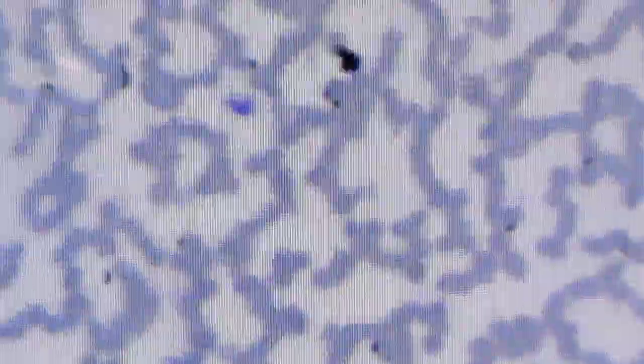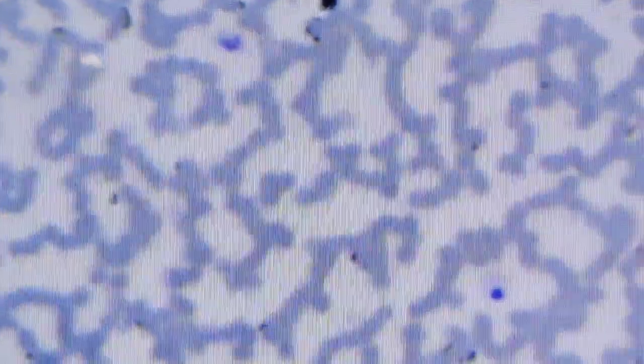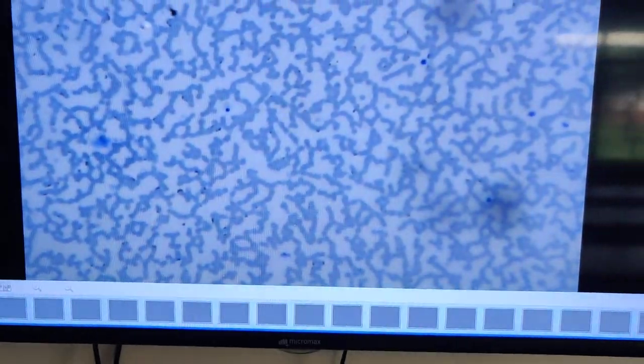And I would like to zoom on WBC, and you can locate, you can see the nucleus, horseshoe shape nucleus in this WBC. Another WBC. So these are different types of WBC in this sample of blood, in this blood film.